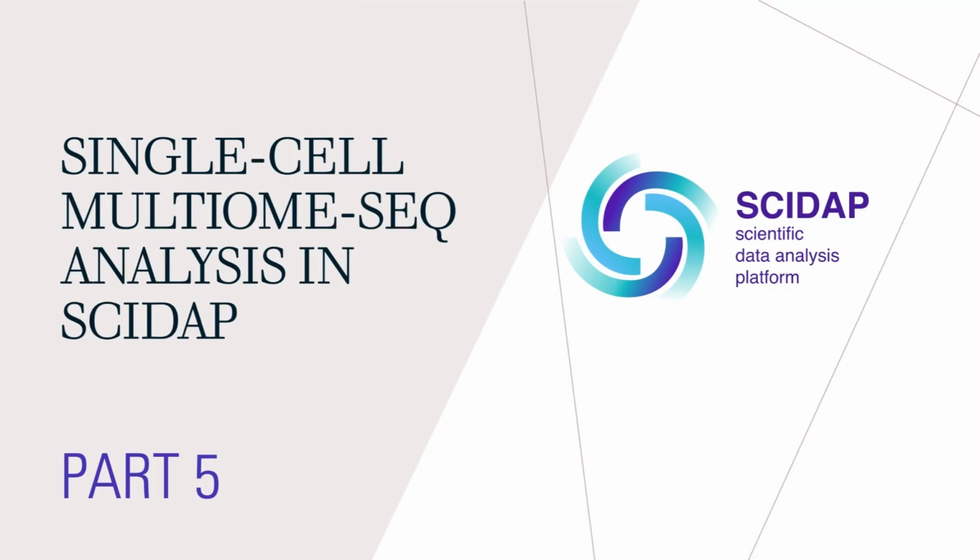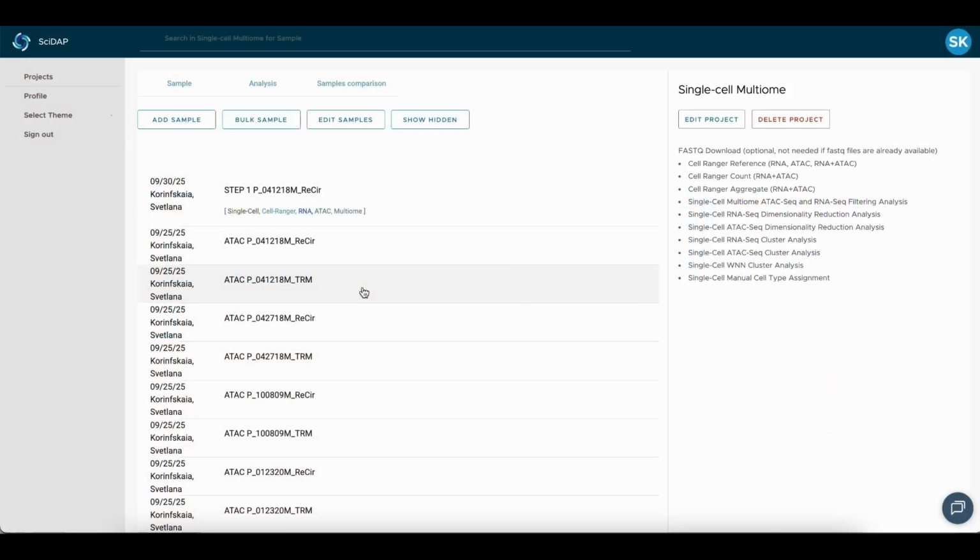Hello and welcome to our single-cell multiome analysis series with SciDAP. In this video we will be reviewing the output of Cell Ranger count that we've started in the previous video.